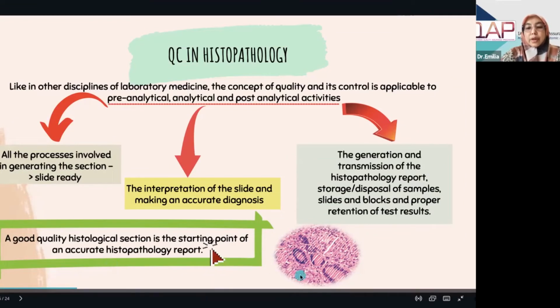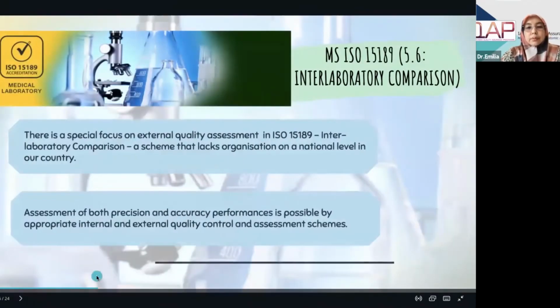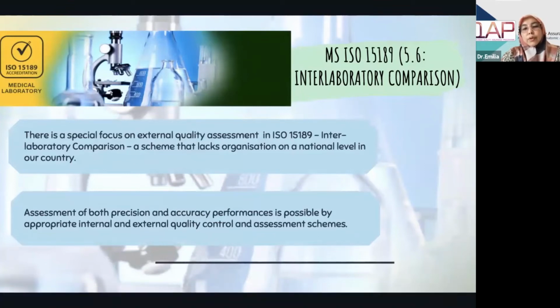We don't want sections that have artifacts, as they will jeopardize the diagnosis later. That's why in ISO 15189, there is a special focus on external quality assessment, under clause 5.6, the interlaboratory comparison, which is very important. Like Prof. Nahayati already mentioned, of course, we have this interlaboratory comparison before we enroll in RCPA, which already has modules, including the technical modules.